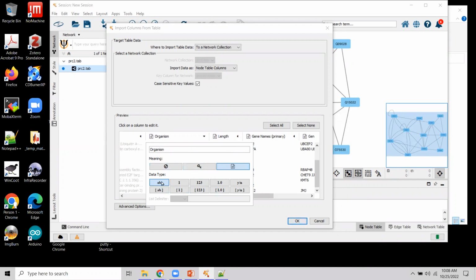So attributes can be either strings or integers, or floating point numbers, or lists of those. Depending on what's in a given column, one of those things can be selected for a column. The values in a column for all the nodes have to be the same, and the same goes for the edges. The attributes have to have the same type for all the rows.